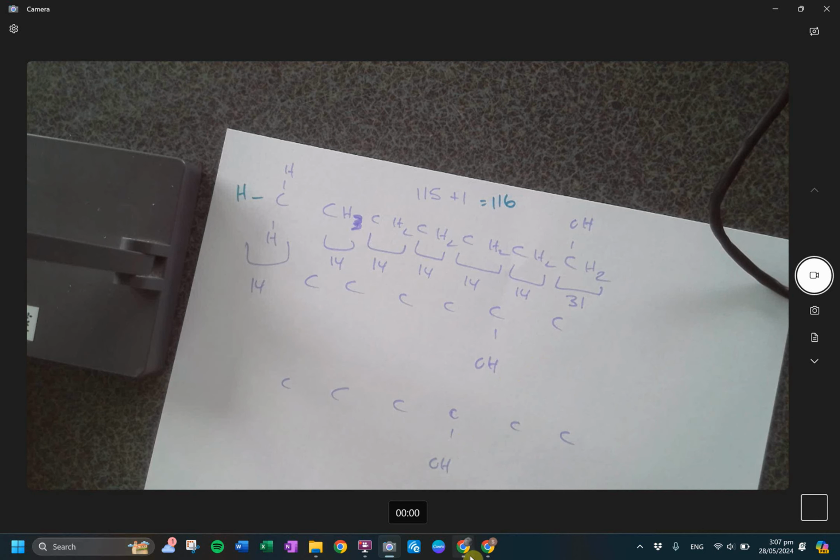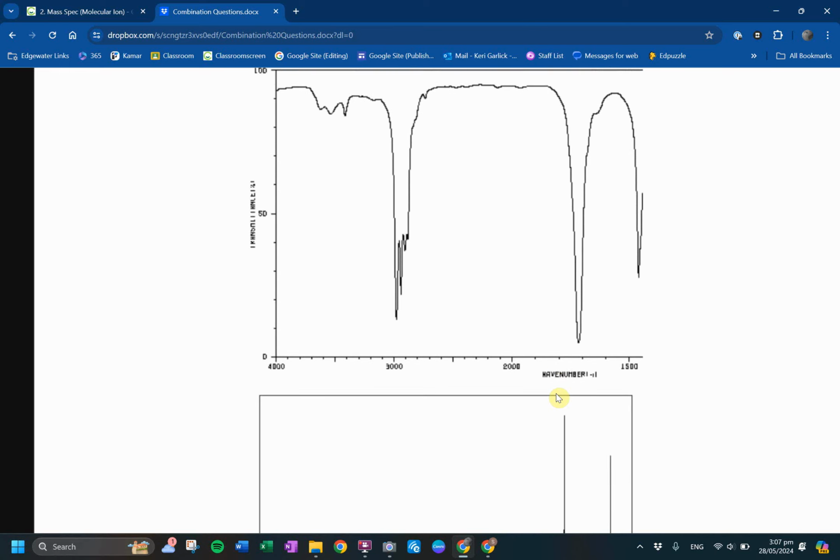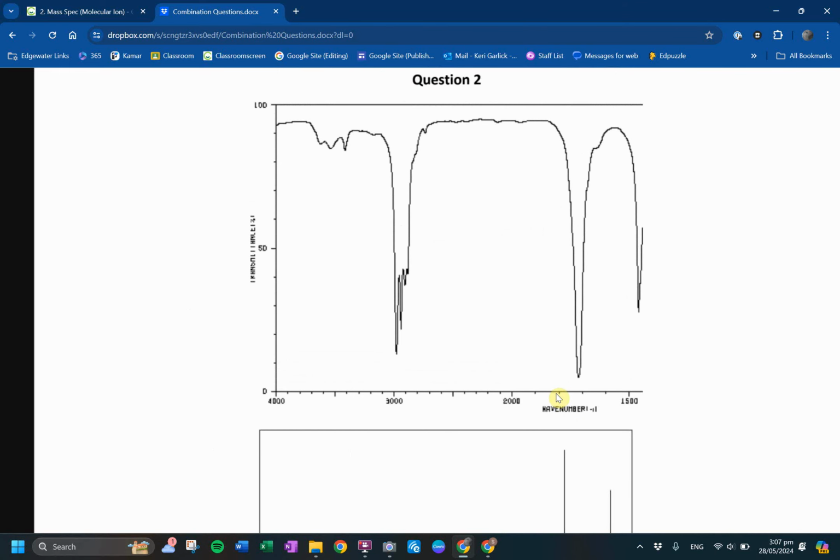So when you guys are looking at this second problem here, what did we figure out? What type of molecule, or what functional group? It's a ketone or aldehyde because it has a carbonyl, but does it have an OH? No, so not a carboxylic acid. Does it have an NH? No, so it's not an amide.